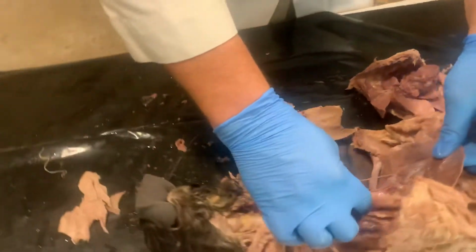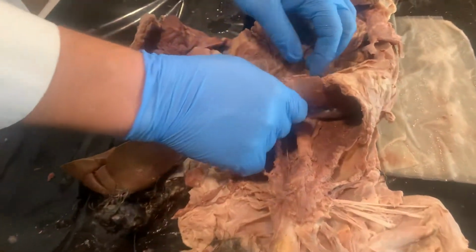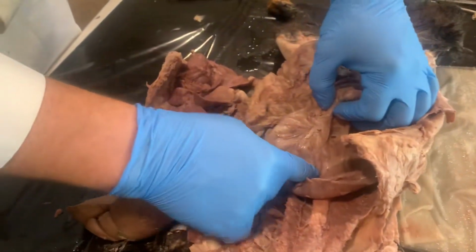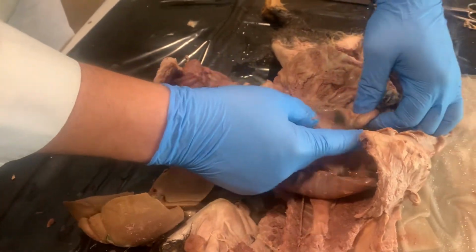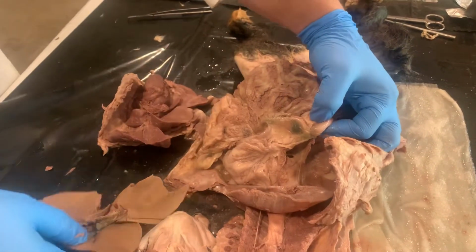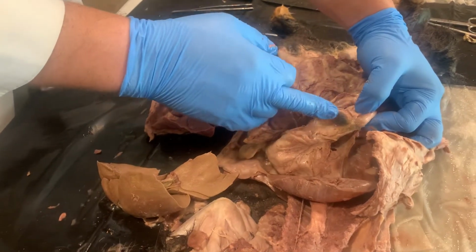So you have your esophagus right here. Esophagus is gonna come down and dive into the diaphragm. On the other side of the diaphragm, that esophagus becomes the stomach. So you have your stomach here. Stomach's gonna curve around and you're gonna have this nice pretty curve right here. The green stain is from the gallbladder, from the bile. That nice pretty curve is called the duodenum.